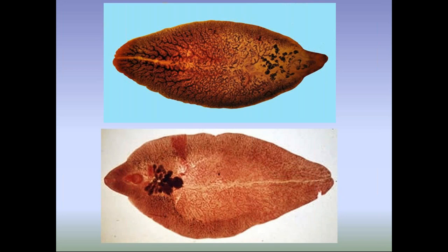Okay, this is about the adult worm. Next, any worm contains not only the adult worm; eggs and larval forms are also present. The eggs are oval in shape, bile-stained, unembryonated and operculated. Operculated means there is a lid at one end, an operculum. A lid-like structure is present in the egg.